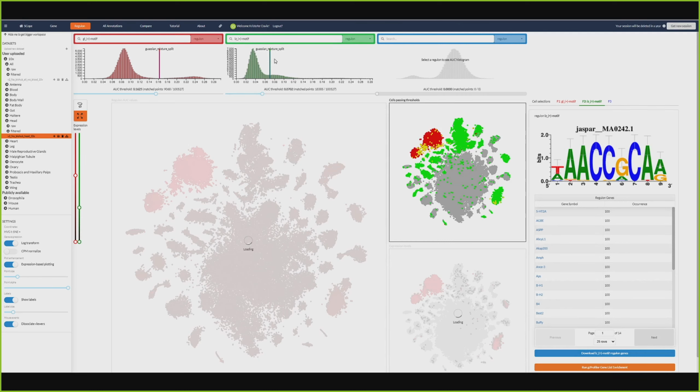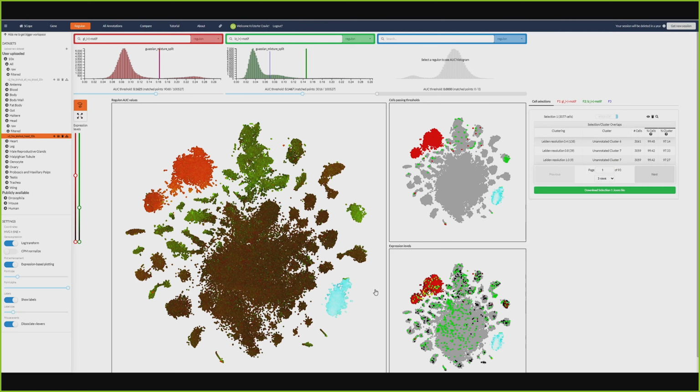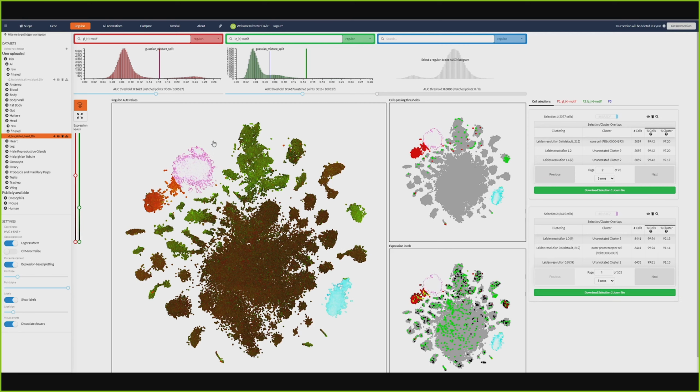I'm also going to show lozenge here. This is for the cone cells, and you can see we've got another different cluster down in the bottom right here that shows up. And here I'll show you where I changed the thresholding to limit which cells in that thresholded plot let me see which are the ones with the highest AUC value, because before that there was a lot of cells which had some activity for that Regulon. You can again go through, use the Lasso tool, highlight them, find out which type of cell that you're actually looking at here. Both the cone cells and the photoreceptors you're able to find.